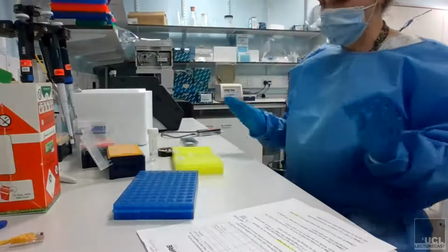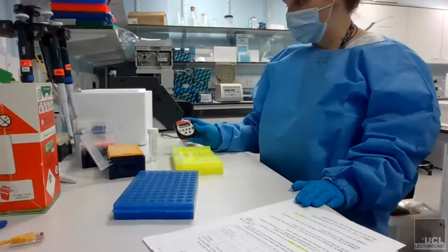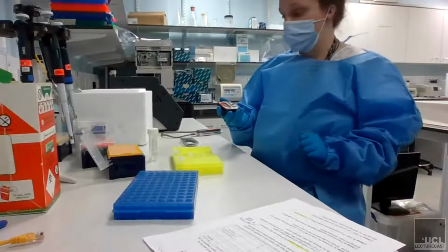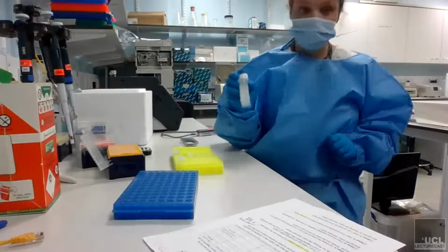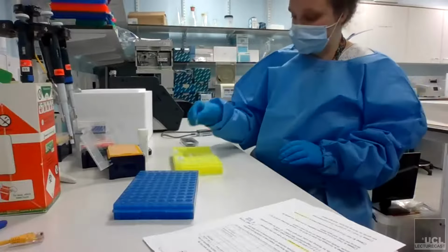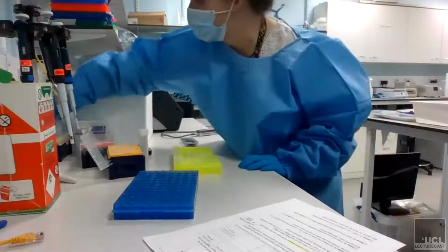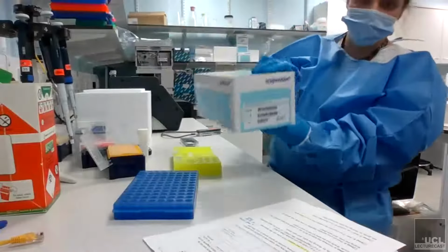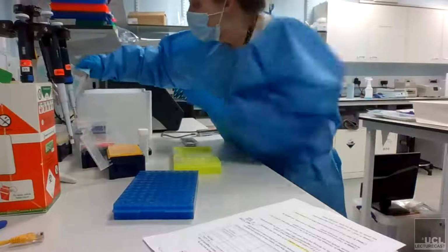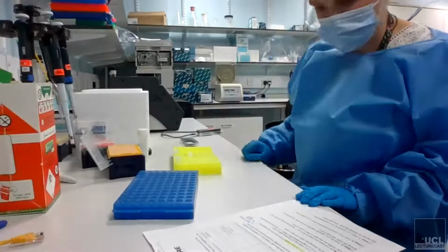Right, so all of my reagents are prepared and I'm ready to start doing stuff. The other things that you'll need are a waste bin, obviously, a timer, because there are various steps where you have to time incubations, and nuclease-free water. You'll need your samples, and you'll need both PCR tubes and also low bind tubes. So we have these DNA low bind tubes here. I think there's a list of the stuff that you'll need on the document anyway.